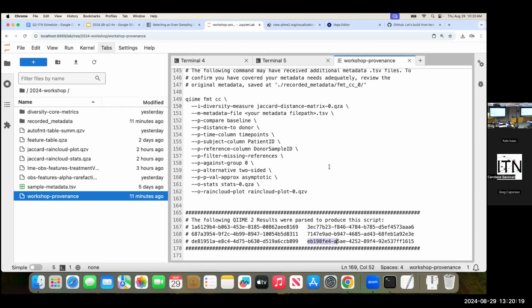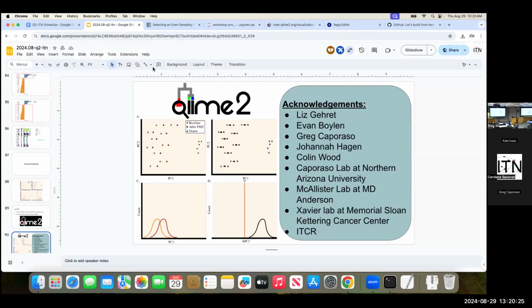Okay, so that for the most part wraps up what we wanted to show you, or what we have time to show you with respect to QIIME2 during this event. And sorry about the flicker.